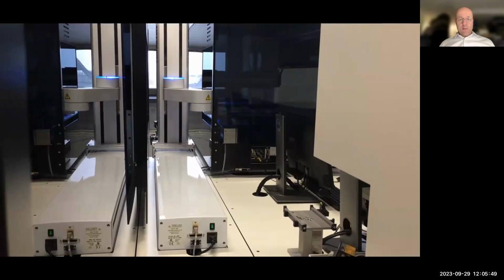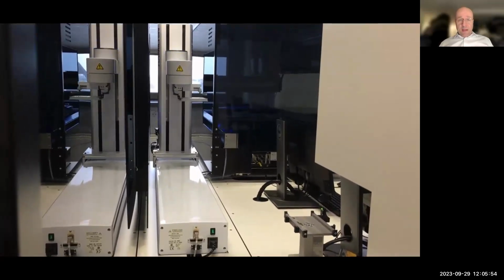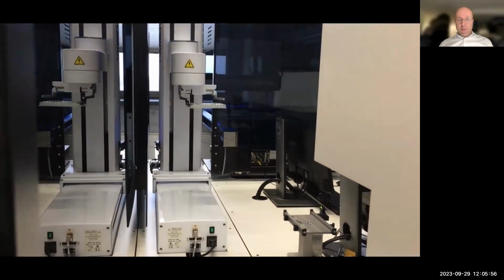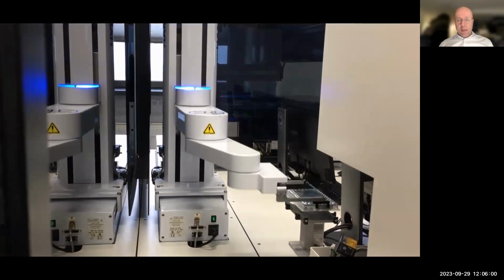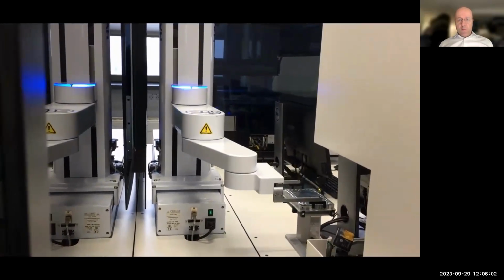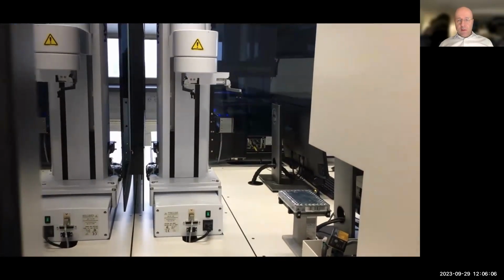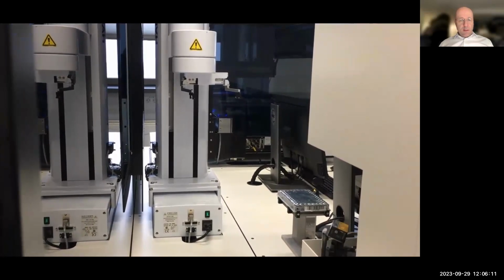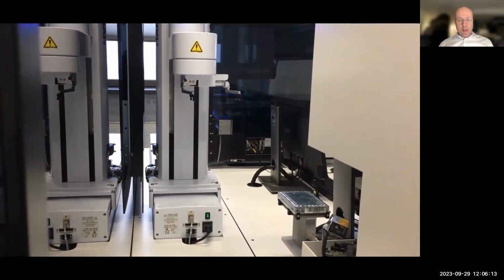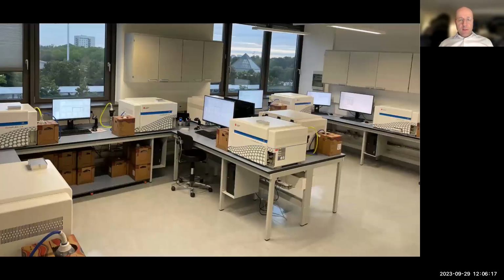You can see here it's quite a sophisticated system handling 4 platforms, and we have a movable arm which brings the plates, in this example the antibody plates, from one platform to the other. You can see here in front that plates are barcoded. So we draw very much attention to automation, and part of that, of course, is the use of barcoding.